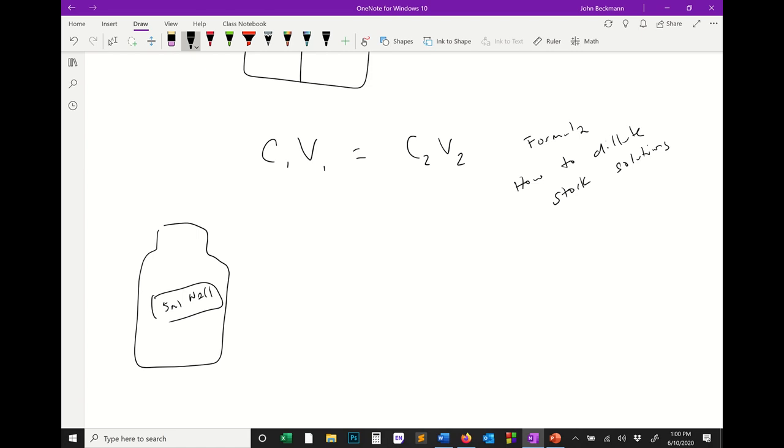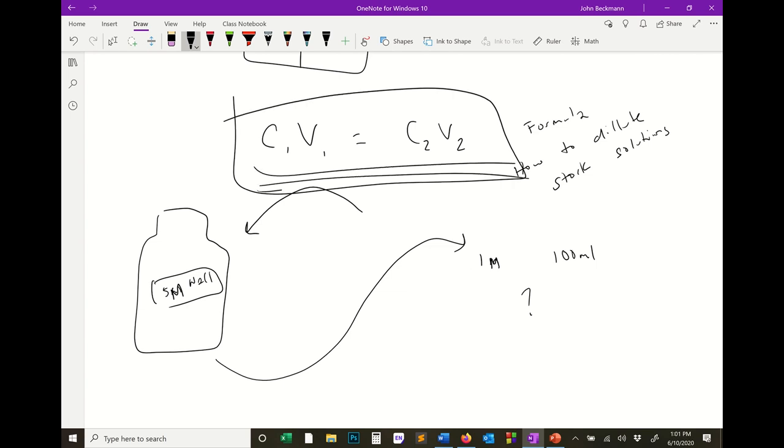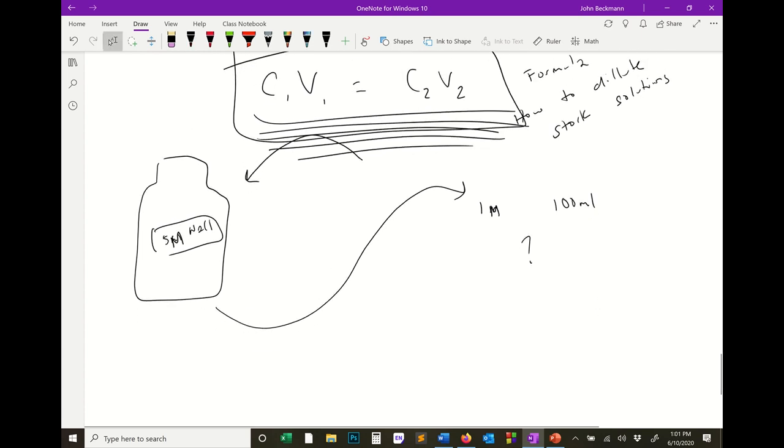Okay, so we already made our 5 molar sodium chloride. Now let's say we want to do an experiment and we want to make a 1 molar solution. I said mil before, that should be molar. And let's say we want to make 100 mils of it. How do we calculate how much of this to dilute in how much volume to make this? Well, you use this formula, the formula you need to memorize and know for the rest of your life. You will learn to love it. So let's use it and calculate how to do this.